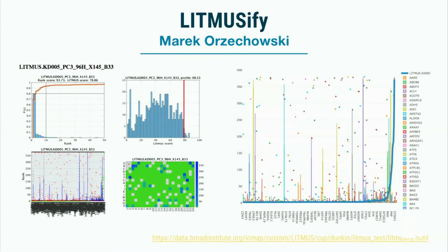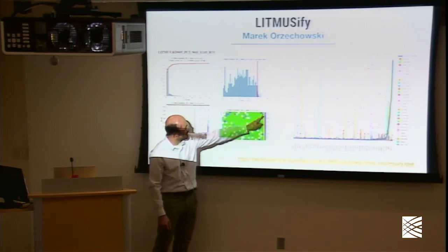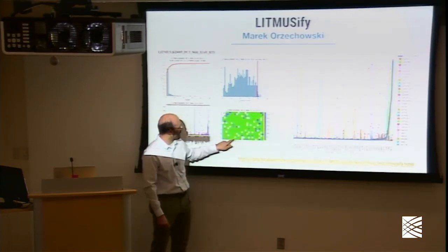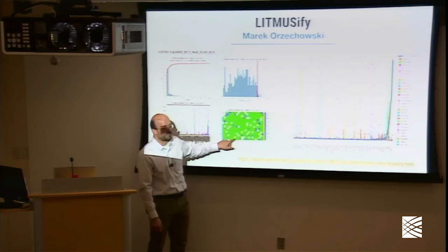And so we had some various measures of that, but Mark really took this to the next level by providing a lot of new figures. And I want to just illustrate this heat map, for example, here. So this heat map, you might notice the really weird color scale here. Well, basically, this is the rank of the knockdown score across the entire plate. And so if the gene in this well worked, it should have a rank of 1. It should be the most knockdown. It should have that gene knocked down more than the rest of the plate.